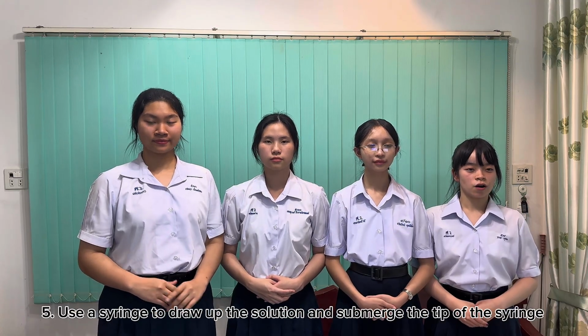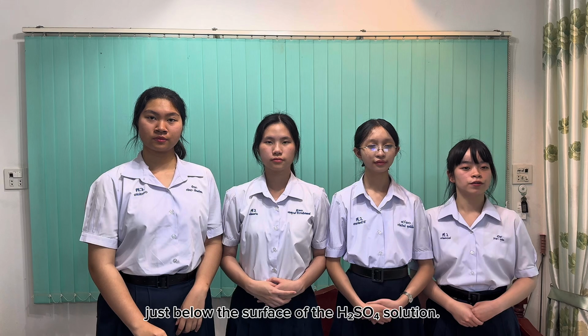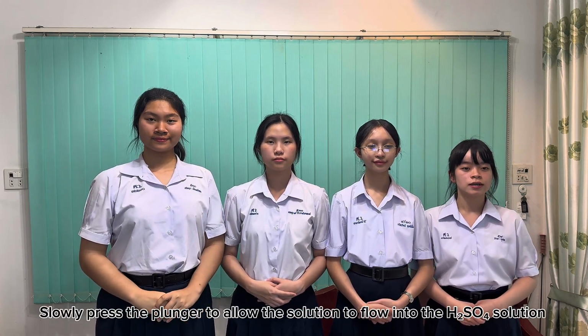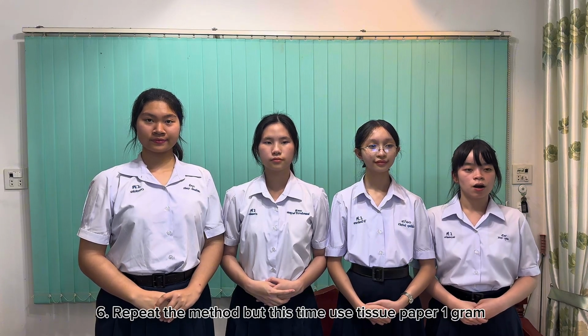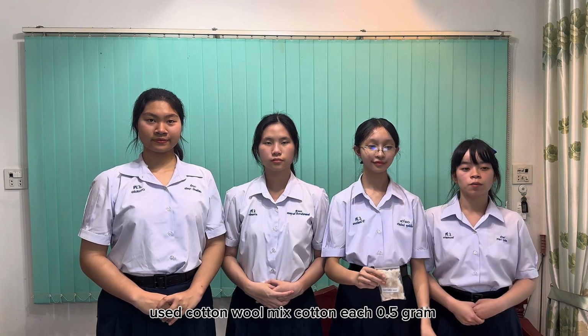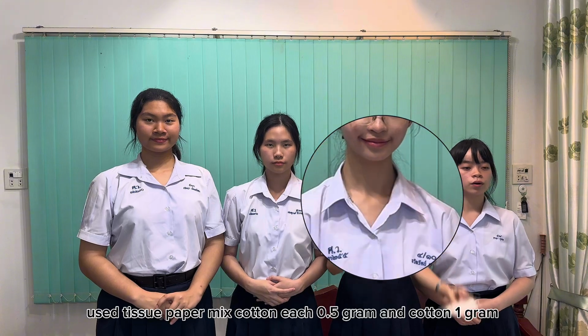Fifth, use a syringe to draw up the solution and place the tip of the syringe just below the surface of the sulfuric acid solution. Slowly press the plunger and allow the solution to flow into the sulfuric acid solution until it is completely dispensed. Sixth, repeat the method, but this time use tissue paper 1 gram. Use cotton wools mixed with cotton, each 0.5 gram. Use tissue paper mixed with cotton, each 0.5 gram, and cotton 1 gram.